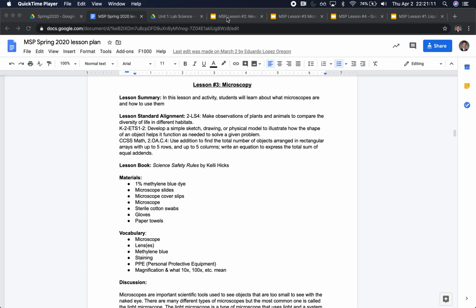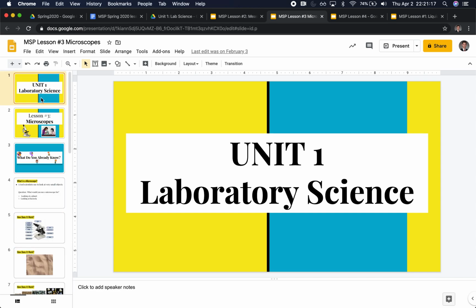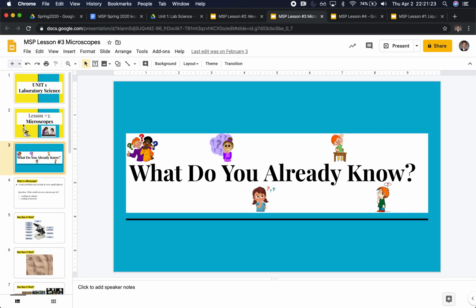So again, I start my lessons with a PowerPoint. This is Unit 1, Lesson 3, Microscopes, and I ask them what they already know. A lot of them know what a microscope is, which is nice. They understand that it's used to look at really small things.